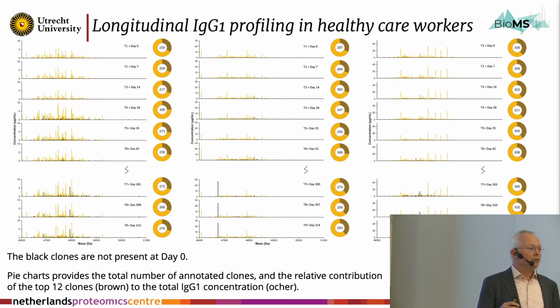What does that mean? We also say antibodies are very good, and B cells are very good in making mutations to mature the antibody, to make it better. This means, because we have exactly the same mass, that these are antibody sequences that are not mutated at all over a year time. So it's really B cells that don't further mature, but keep making the same antibody, in this case for nearly a year, even when they are challenged with a vaccination.